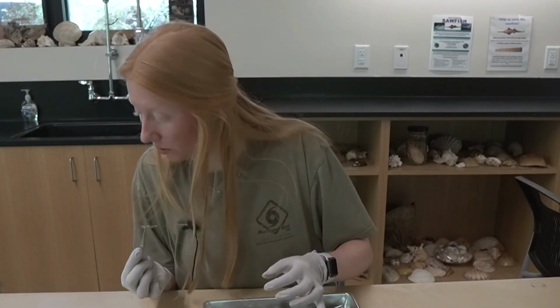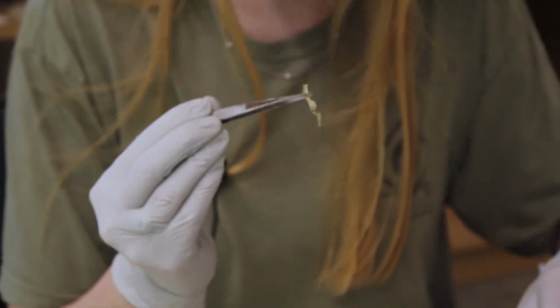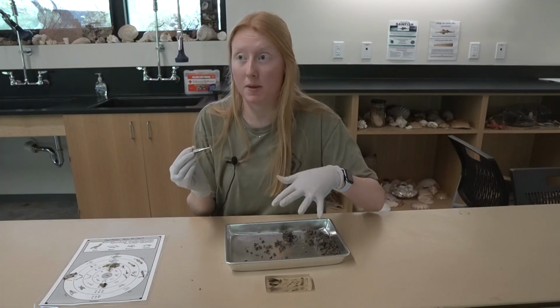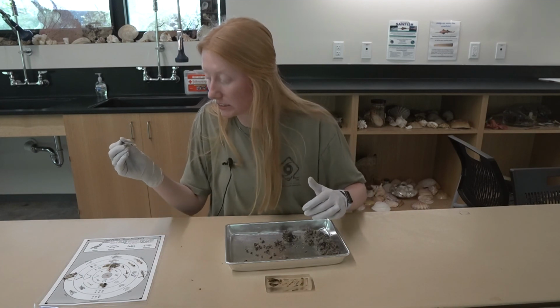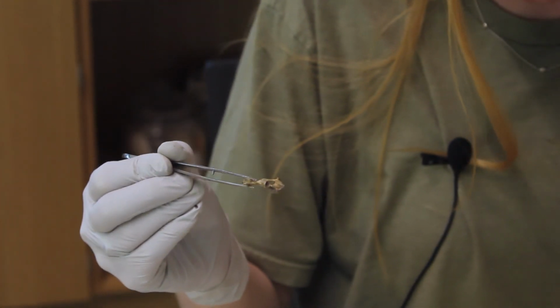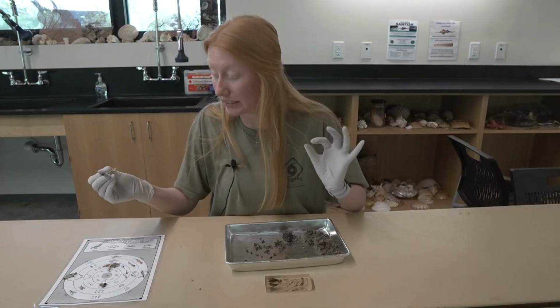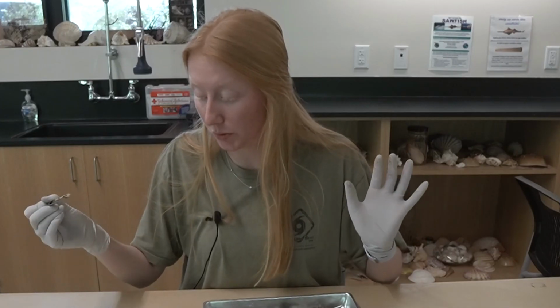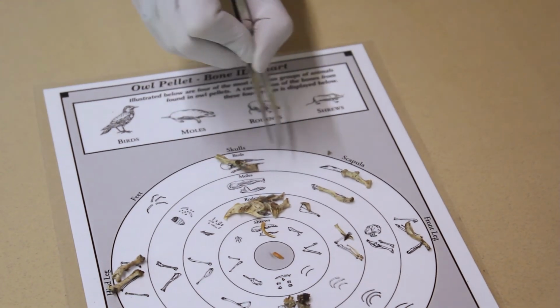Okay. Another cool thing. I broke off the tip of it and it seems to be pneumatic, or have those air pockets, semi-hollow. So I believe this would be kind of like a scapula maybe, or maybe a part of the leg. I'm not exactly sure, but still really, really cool. Let's just throw it onto the bird paw. Right there.